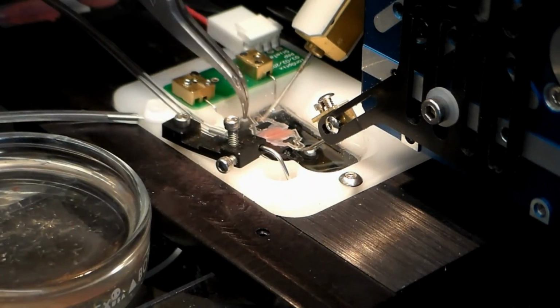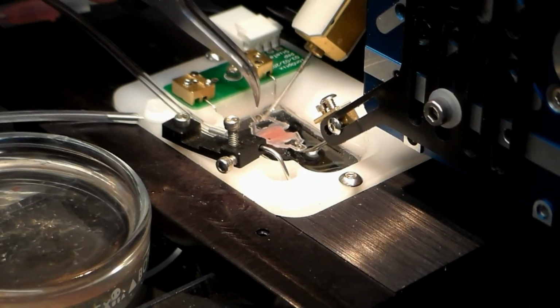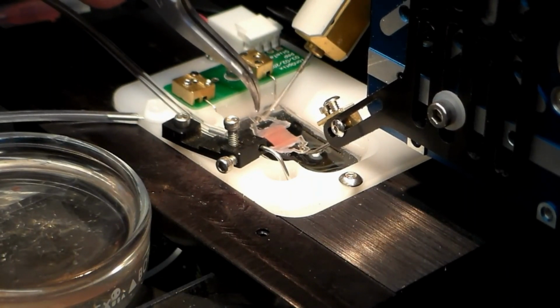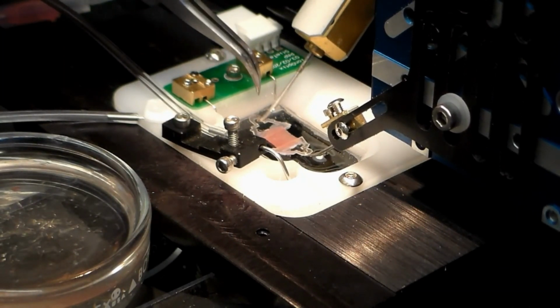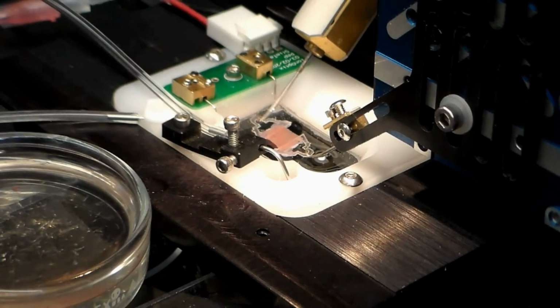And then we can adjust the length of the slice so that it will develop tension between the two hooks. And that is basically the clipping and loading of the cardiac slice into the apparatus.